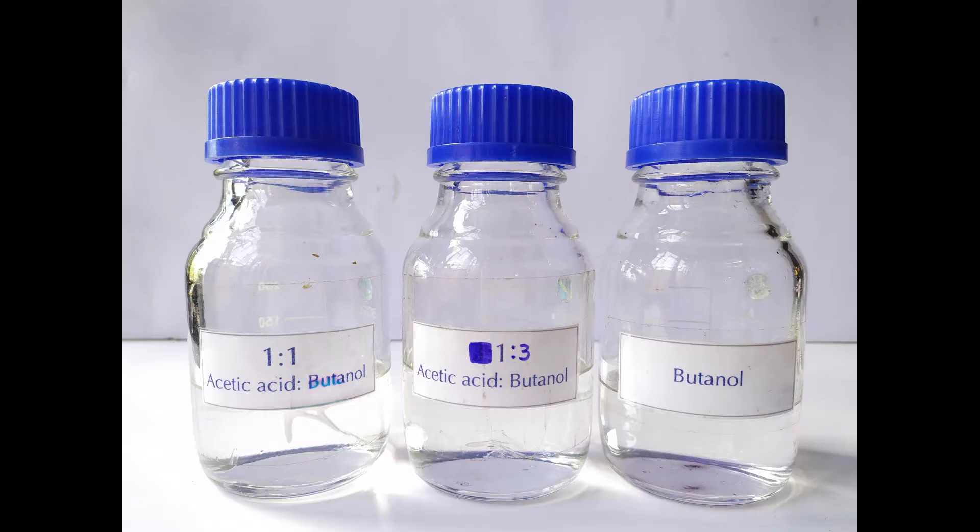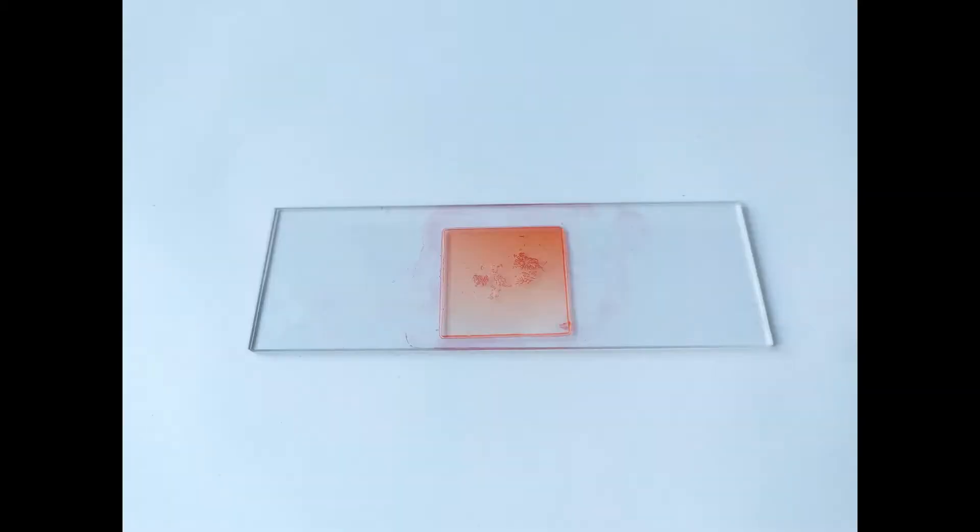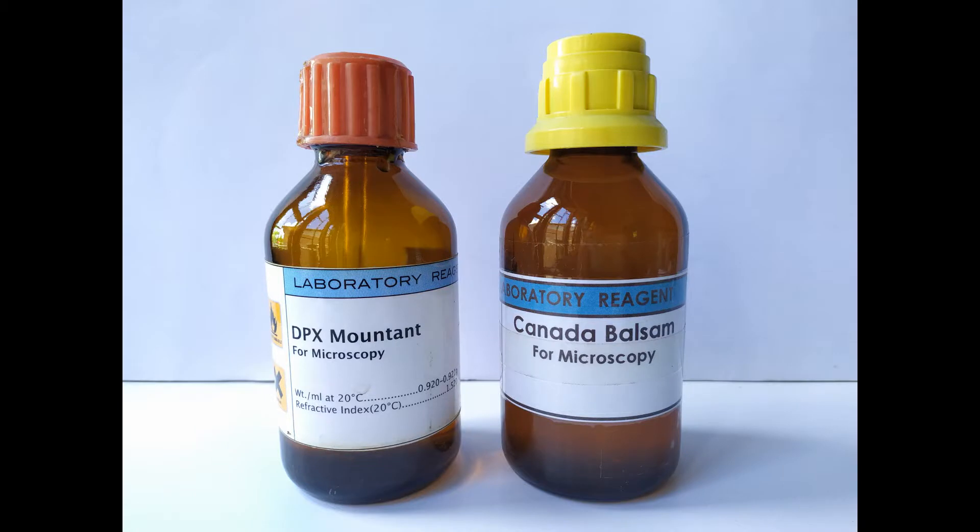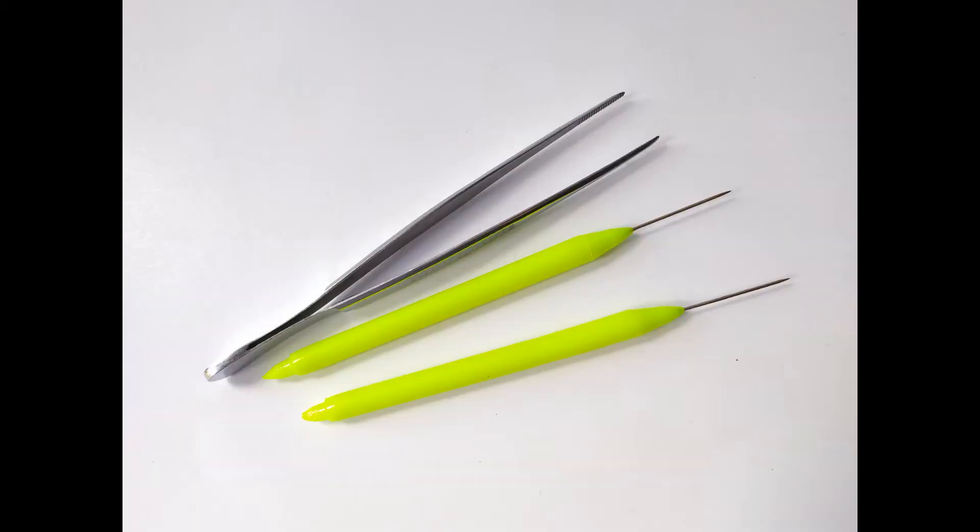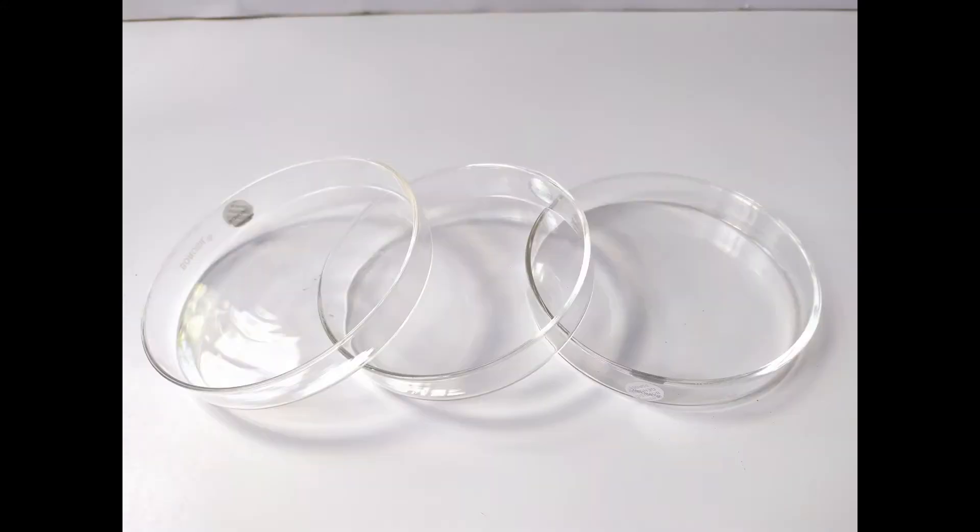You'll need butanol and acetic acid in equal parts, 3 to 1 butanol and acetic acid, pure butanol, temporary cytological slide preparations made previously, mounting mediums such as DPX or Canada Balsam, forceps or tweezers and pins, petri dishes, glass slides and cover slips.